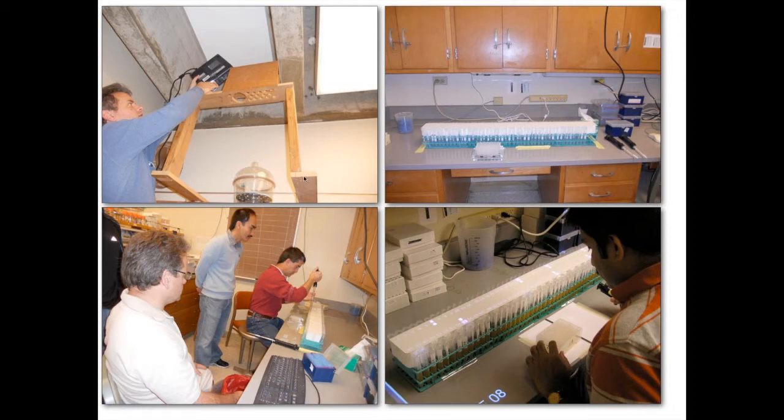Here's a little stand built out of pieces of wood and an LCD projector connected to a computer terminal. The computer terminal runs a little software program that controls the output from the projector. It's set up to match the geometry of the work area, so it shines down on the work area and shines lights and markings that help the pooler see where to pool samples. So we do the pooling manually.